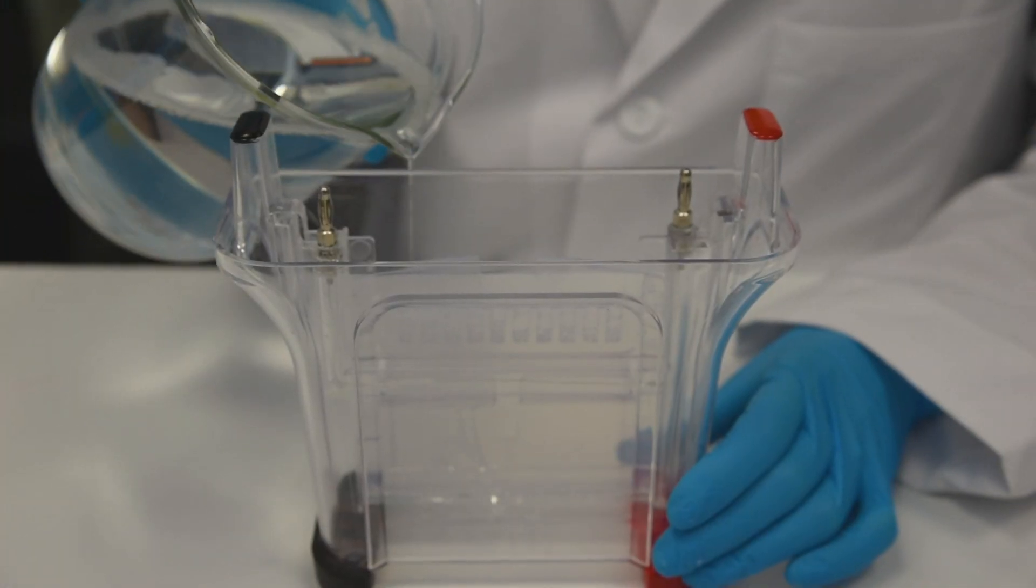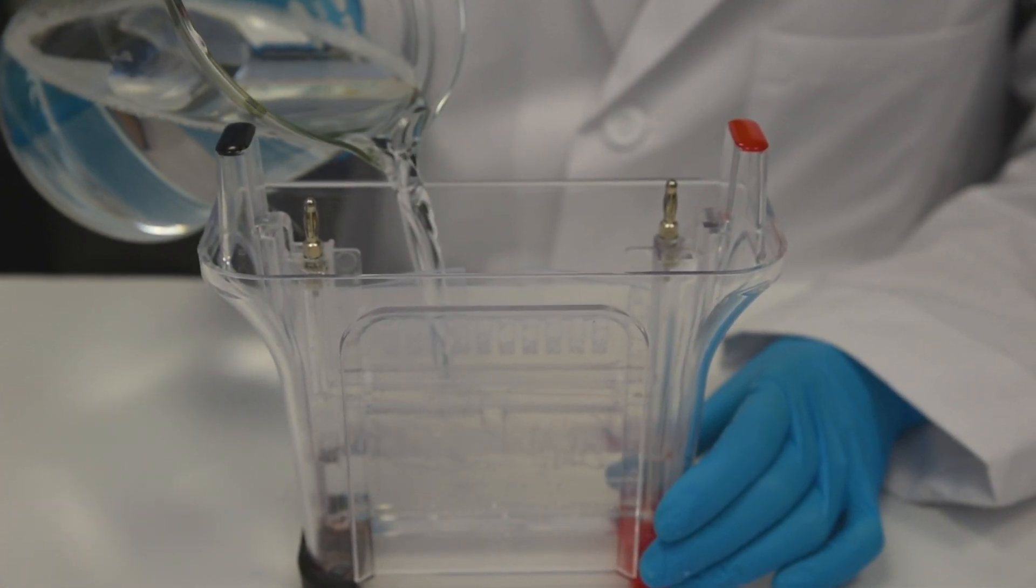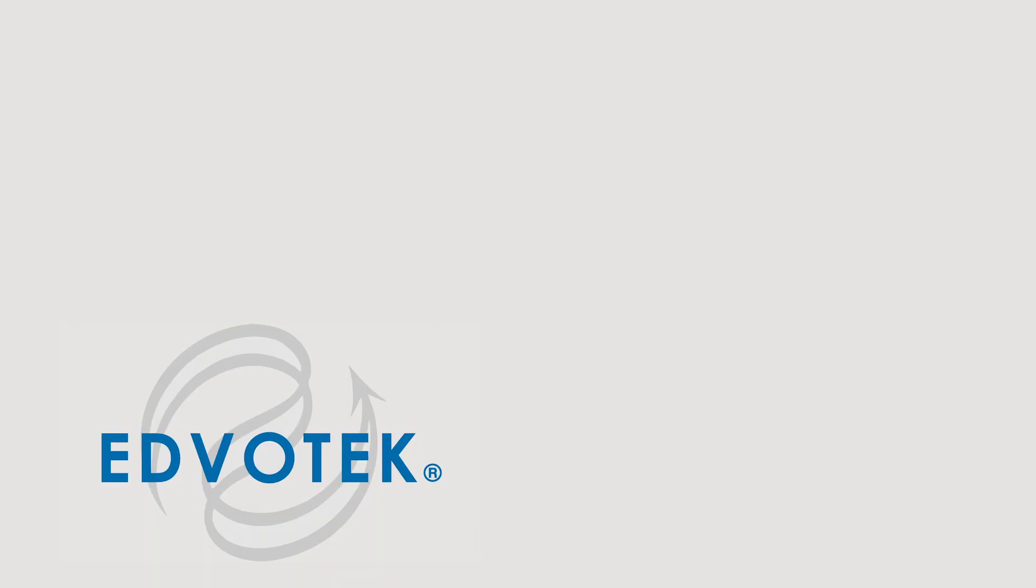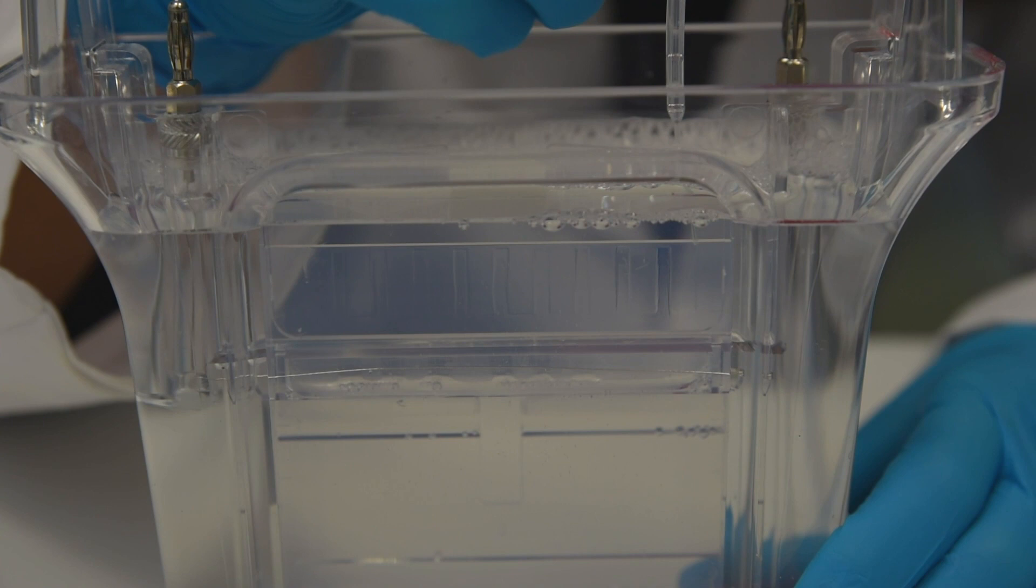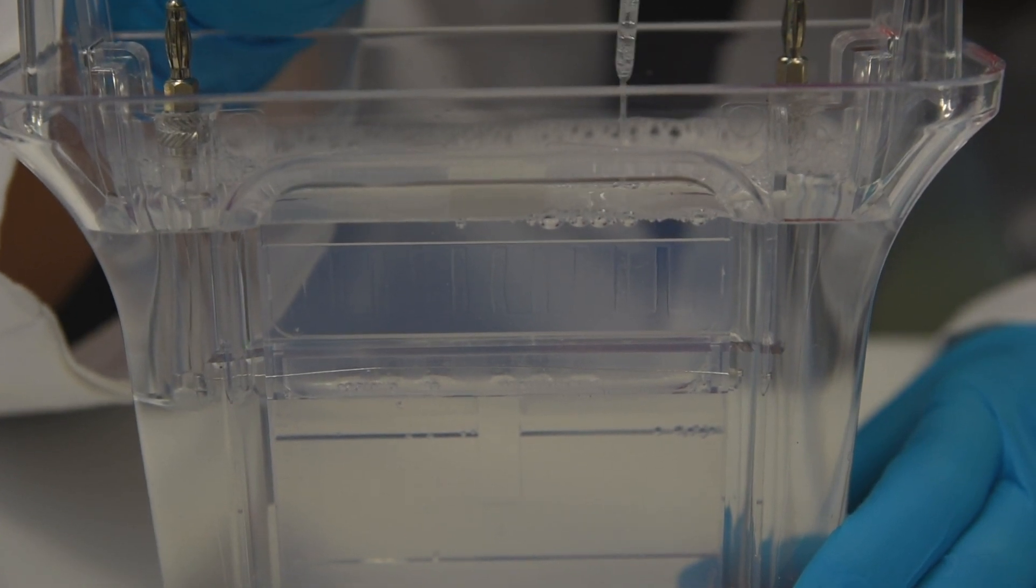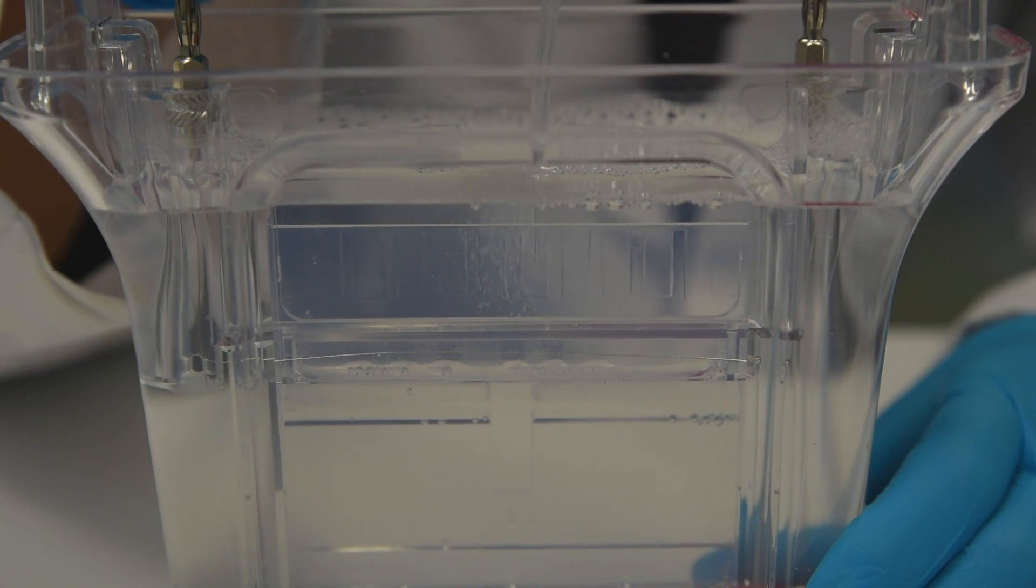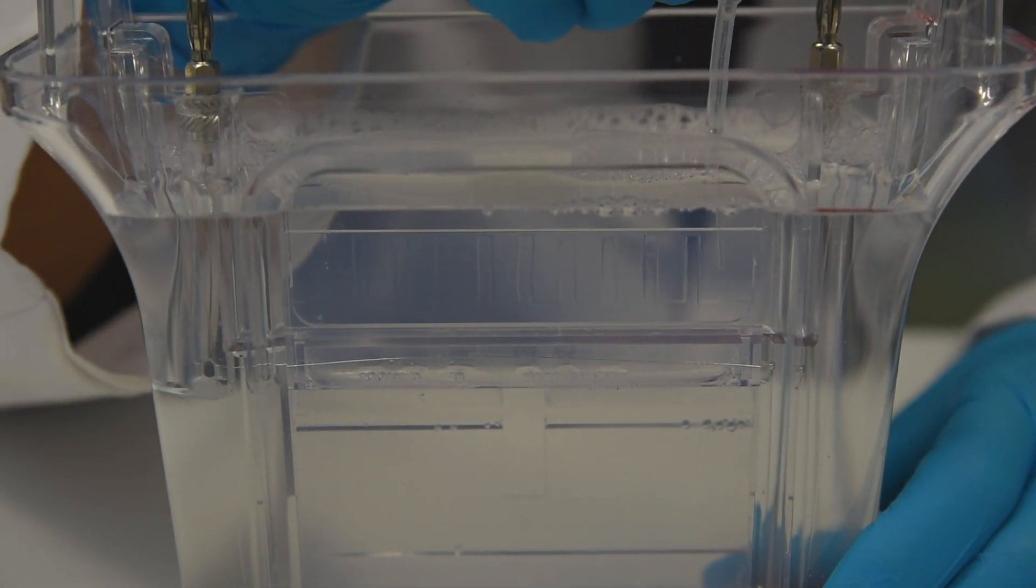Step 5: Add diluted electrophoresis buffer to the chamber until it covers the top of the shorter front plate. Step 6: Rinse each well by carefully squirting electrophoresis buffer into the wells using a transfer pipette. The gel is now ready for sample loading.